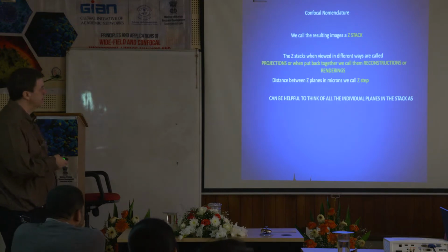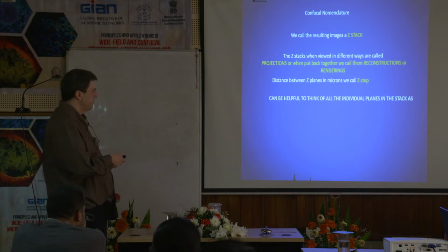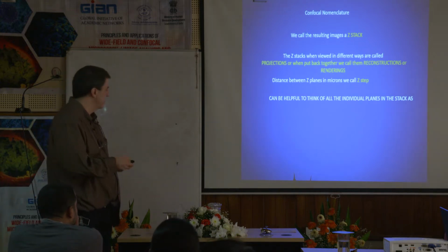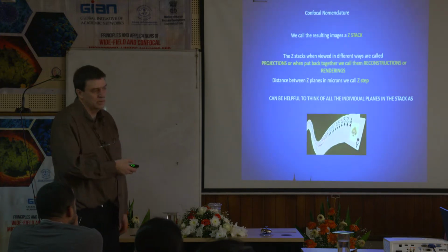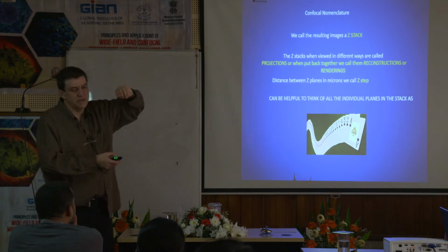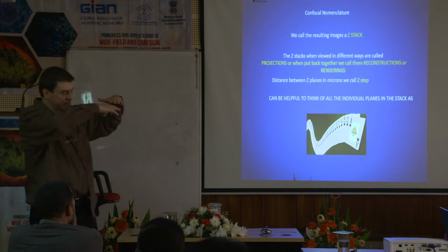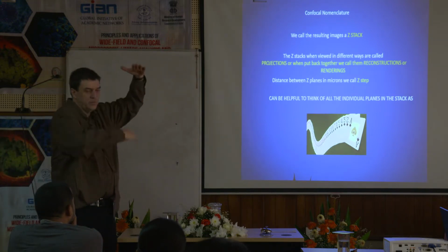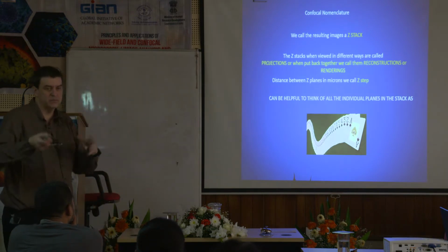The way I think of it, and the way I tell people to think about it, is something common, I think. I haven't seen anybody doing it here yet, but I'm guessing you probably do this in India too. It's like a deck of cards. You're taking a deck of cards, the top card, the next card, the next card. Each picture is like a card, and if you put the whole deck of cards back together, you build the picture back together.